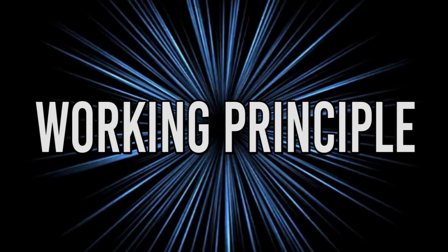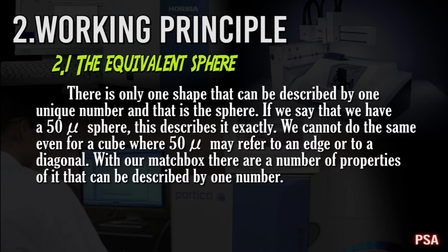Working principle: the equivalent sphere. There is only one shape that can be described by one unique number, and that is the sphere. If we say that we have a 50 micron sphere, this describes it exactly. We cannot do the same even for a cube, where 50 microns may refer to an edge or to a diagonal. With our matchbox, there are a number of properties of it that can be described by one number.